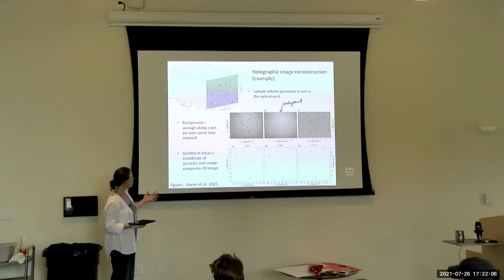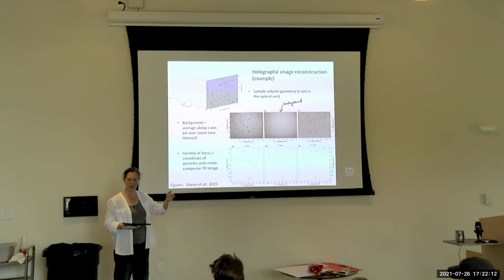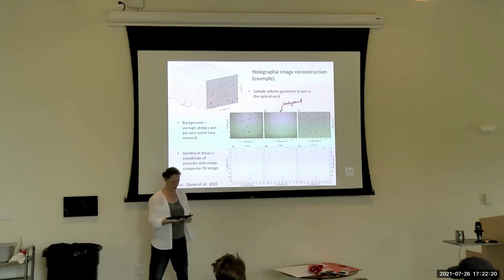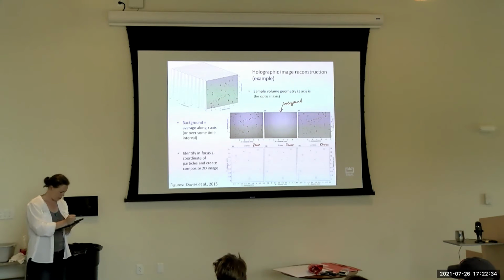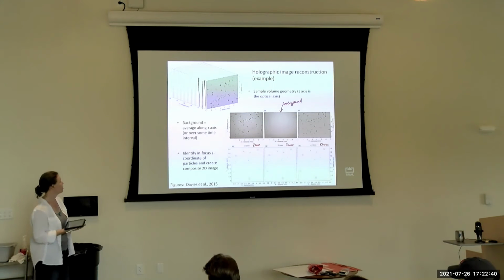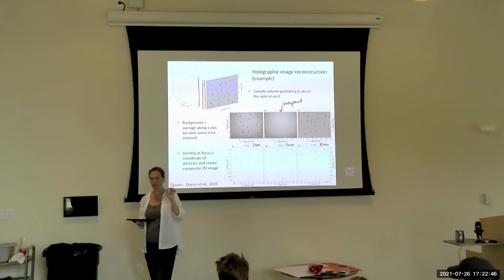that numerical reconstruction, you end up getting a three-dimensional image that's got some particles in focus in one plane and other particles in focus in a different plane, which is illustrated here. So you can't really see the details here. This is at 2 millimeters and 5 millimeters and 10 millimeters going along the z-axis of the image cube. So for instance, up here, 2, 5, 10 millimeters, right? They're just these slices going back. And so you can see that in each slice, there's different particles that are more or less in focus.